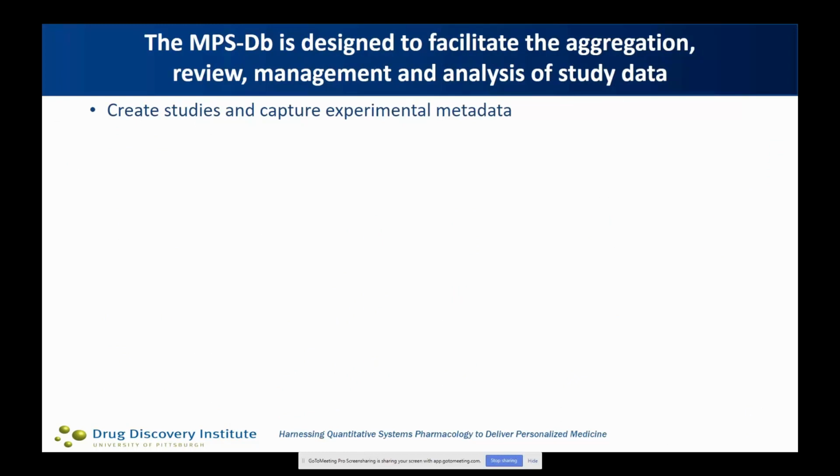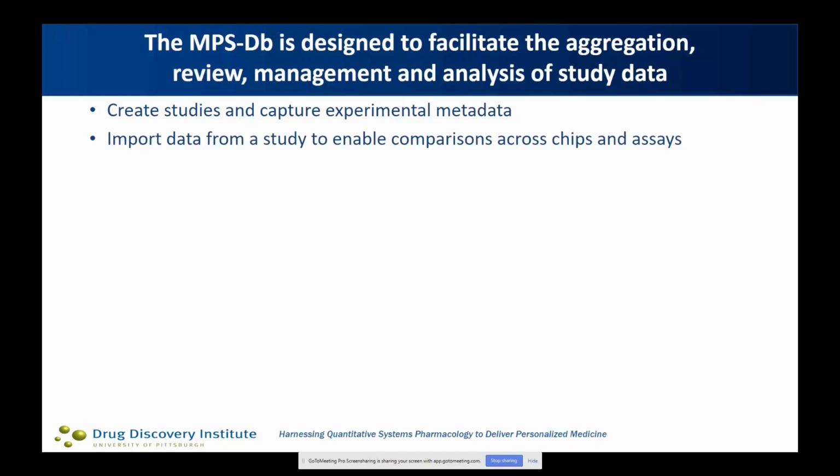So the database was designed then to create these studies and capture the experimental results from the studies along with the metadata for the experiments. And I think capturing the metadata is perhaps one of the more challenging aspects of the process, because each individual laboratory handles their metadata in their own way. And what we've done is worked with these tissue chip testing centers in particular to try to reduce that down to a standard format in which they can encode the experimental protocols that are used, so that when we have the data, we can associate the data with the experimental treatments.